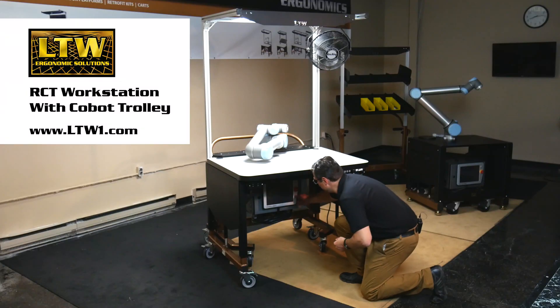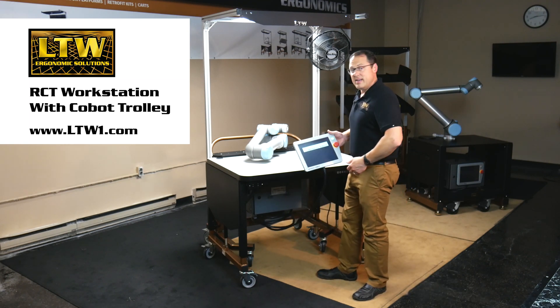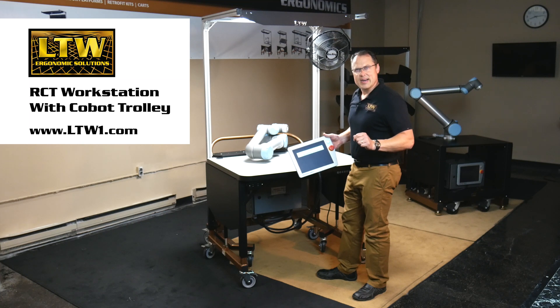We can go ahead and grab the controller, get it powered up, and program it to do whatever you need it to do. To learn more, go to LTW1.com. Get your ergonomic on.